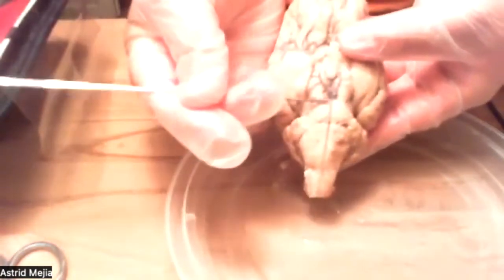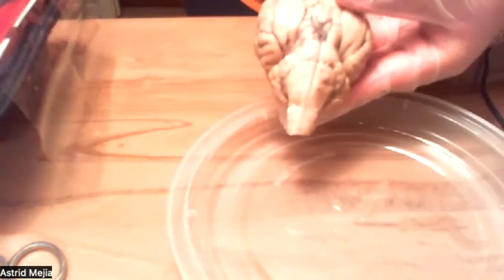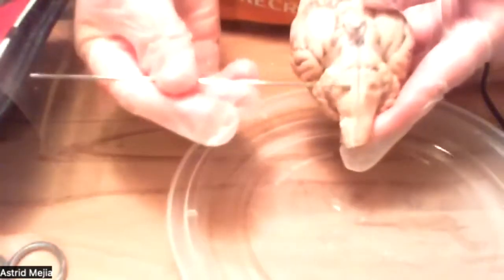And then last but not least, for this part, it would be the pons, which is basically this part right here. This provides a route for signals to travel to and from your brain. And from this view, you can also see the medulla, which is this.